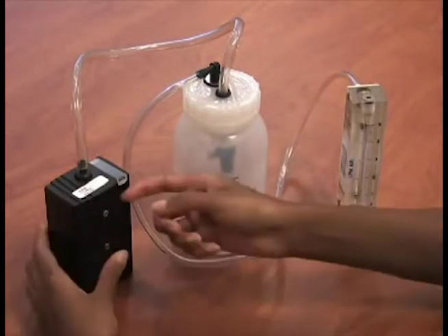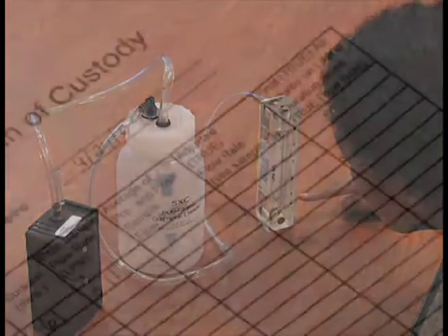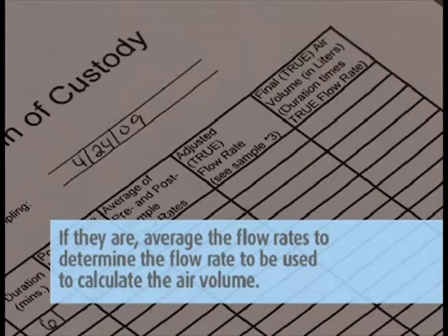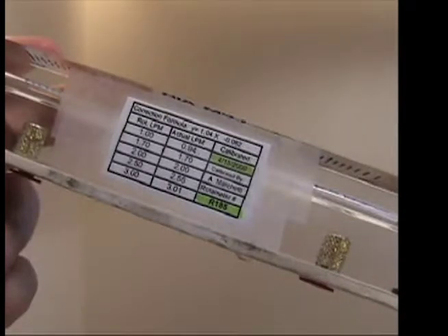Do not make any flow adjustments to the pump — just record the flow rate on the pump calibration sheet. The pre- and post-flow rates should be within 10% of each other. If they are, average the flow rates to determine the flow rate to be used to calculate the air volume. This calibration formula is located on the side of the rotometer. Take the average rotometer reading and plug it into the calibration formula where the X is to determine your actual flow rate.